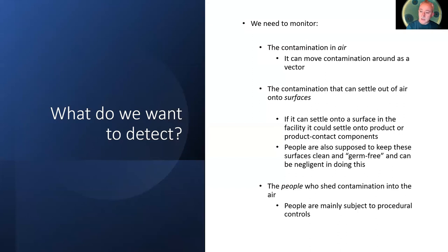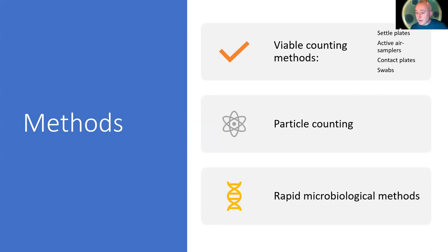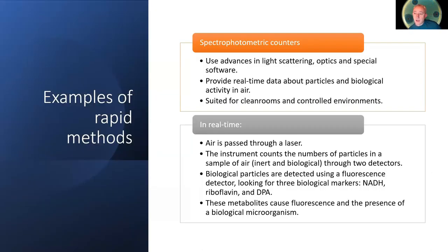We also need to assess contamination on surfaces through the use of contact plates and swabs, and also undertake personnel monitoring. The classic monitoring techniques include settle plates, active or volumetric air samplers, contact plates, swabs, and particle counters which assess the overall numbers of particles in the air. There are also various rapid microbiological monitoring methods emerging, ranging from bioluminescent swabs to spectrophotometric counters.